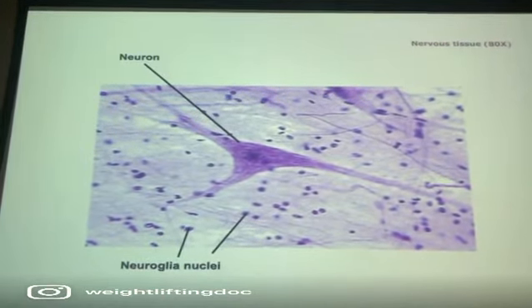Okay, we're in compact bone. Compact bone, you can say one of two things. You can say compact bone, you can say osseous tissue. Do not just say bone. Make sure it's compact bone or osseous tissue. What you're going to see, in fact, let's look at this one first. We'll get back to that. What you're going to see are these, almost looks like a bunch of tree stumps that we cross-sected, okay?